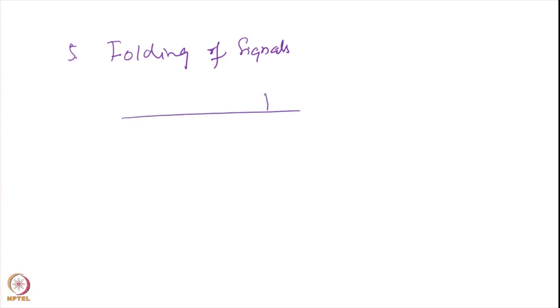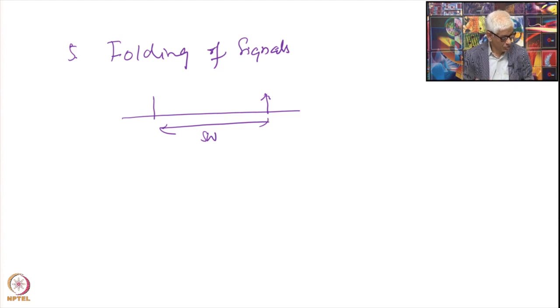Okay. So now a consequence of this will be, suppose you make certain mistakes and you don't choose this dwell time properly, and then you are not covering all the frequencies correctly. So what will be the consequence of this? This leads to what is called folding of signals. And that is the following. Suppose I choose a carrier at this point and my spectral width up to here. I chose a spectral width because I chose a dwell time according to that. This is what I assumed to be the largest range of frequencies, because a priori you do not know the range of your frequencies. You arbitrarily choose some numbers, that okay, my frequencies are supposed to be present within this area.